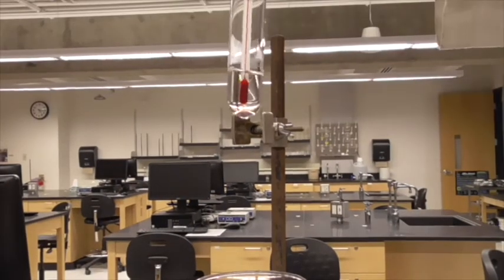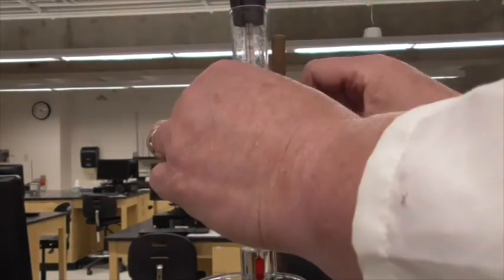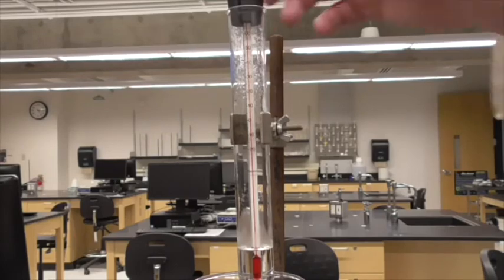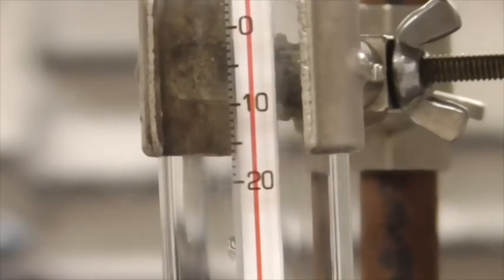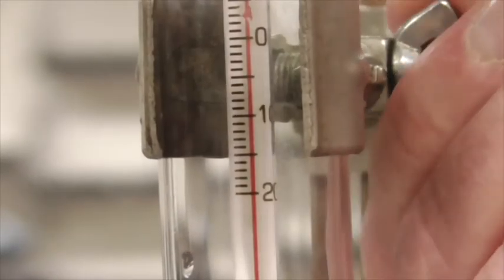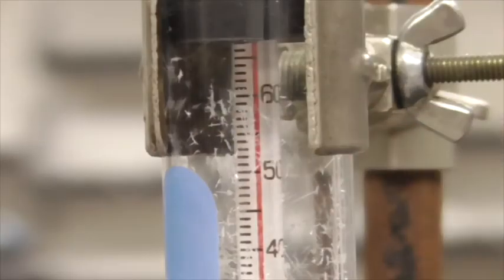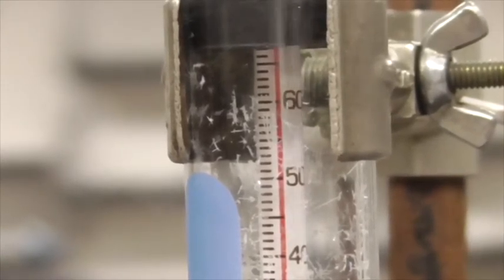Okay, so I've got my sample. I'm going to put it in the clamp here, and I've got my 40-degree water ready to go. It tells us we need to start taking readings at 60 degrees. Let's zoom in a little bit here and see if we can get somewhere close to it. Okay, so we can see our temperature. So I'm going to drop it in the water. Once it hits 65, we need to start taking readings every 30 seconds for basically 30 minutes. Okay, so you can see that we're still above 60 degrees.